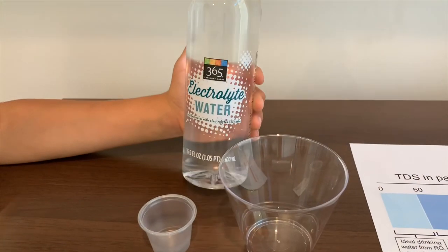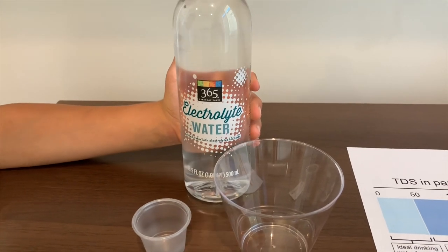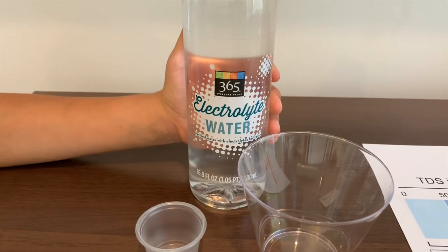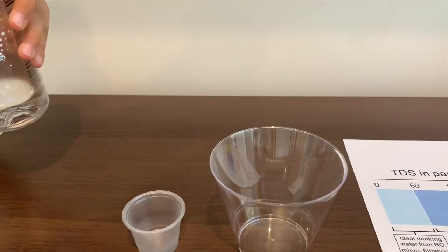This is also a 365 Everyday Value water. This is electrolyte water and purified water with electrolyte for taste. Let's pour some water.